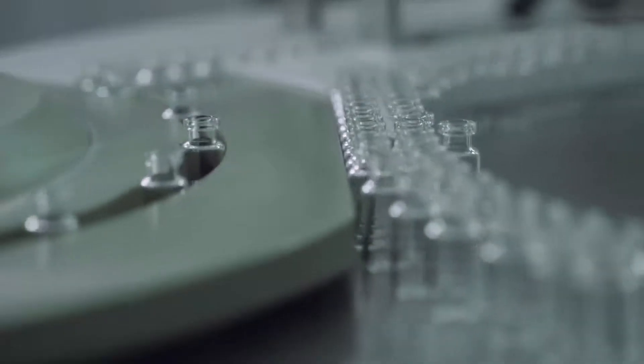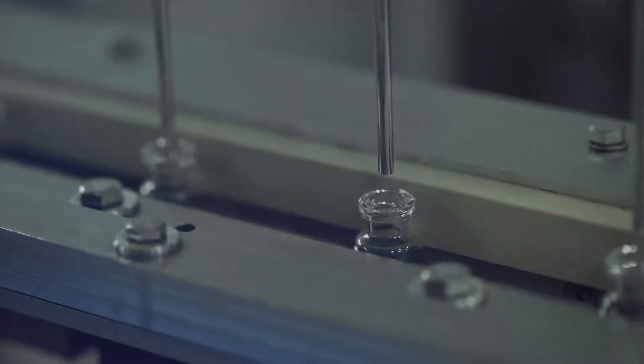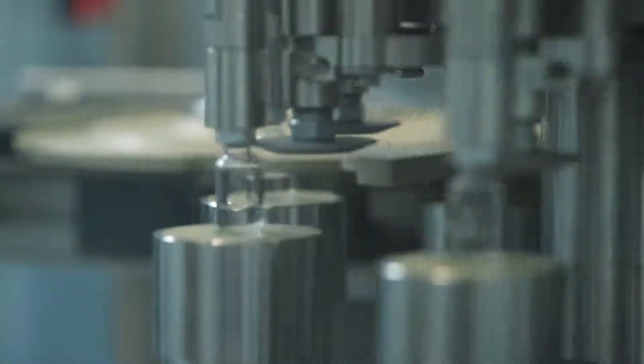The different capabilities that Leon offers that LS&E hadn't offered before are a few and they're very important to our clients. We do mostly vial filling and lyophilization. The Leon facility allows us to do pre-filled syringes and ophthalmic bottles.